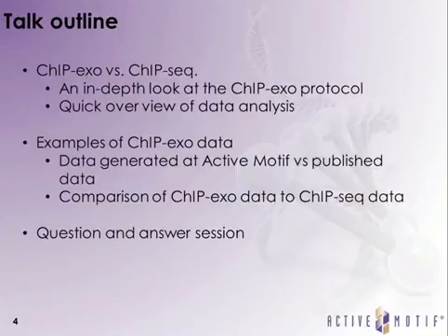This will be followed with ChIP-Exo data that we have generated here using the kit that we've recently developed at Active Motif versus that which has been publicly available and published in PubMed. In addition, we'll also have a comparison of ChIP-Exo data to ChIP-Seq data and how it relates and how it differs. And at the end, as Mason said, we'll have a question and answer session.